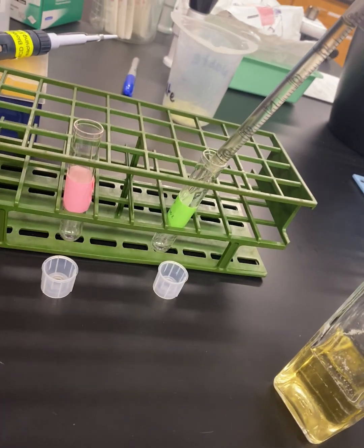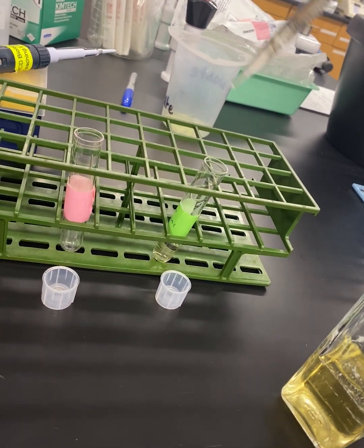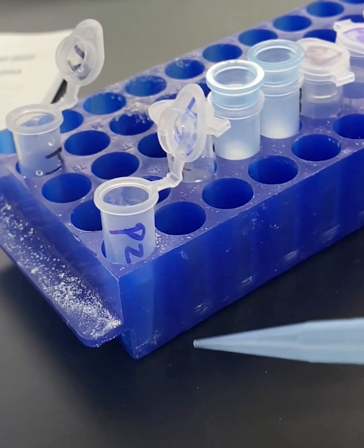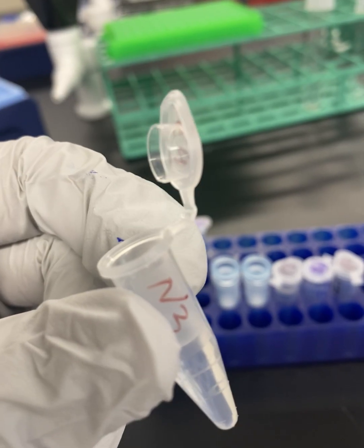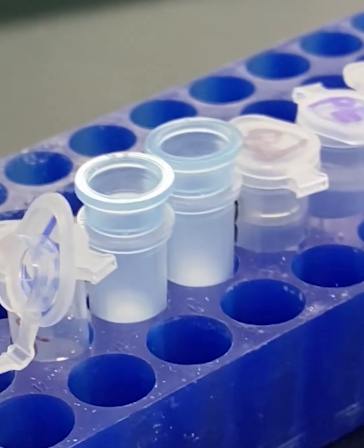These overnight colonies are used for mini-prep. SDS and sodium hydroxide lyse the cells and denature DNA. This is in buffer P2. Neutralization precipitates chromosomal DNA while plasmids rapidly reanneal and stay in the solution. This occurs in buffer N3. Spin columns purify plasmid DNA effectively.